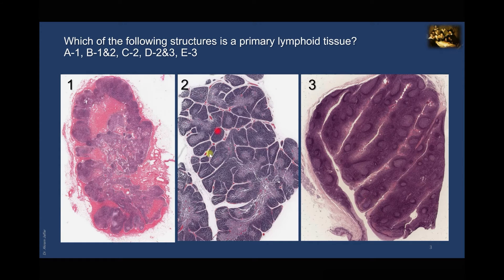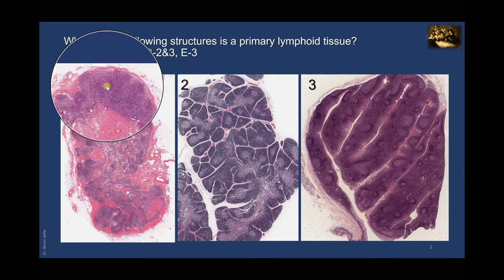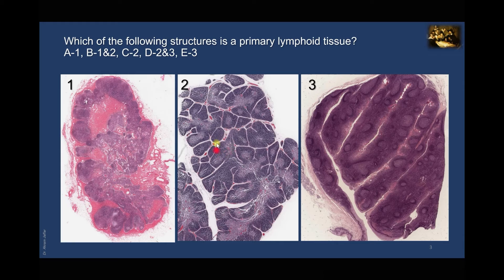Looking at slide two, it shows a lobulated organ invested by a fibrous capsule from which short interlobular septa radiate. You can see a dark-staining outer cortex and a lighter-staining inner medulla. The cortex does not show lymphoid follicles like those in a lymph node, so image two is not a lymph node — it is the thymus, a primary lymphatic organ where maturation of T lymphocytes takes place from lymphocytes derived from bone marrow. Therefore, the correct answer is C, image two only.